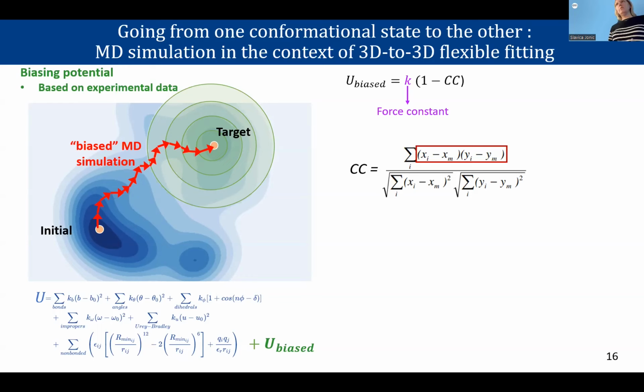So I'm basically maybe fitting noise and not the object in the data. So K is the most difficult factor to set the value of.